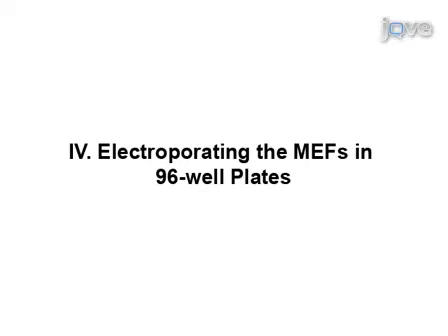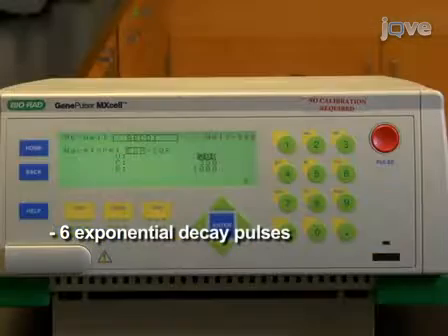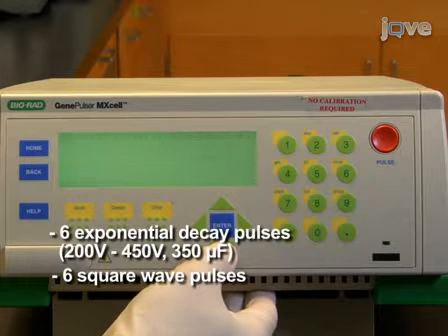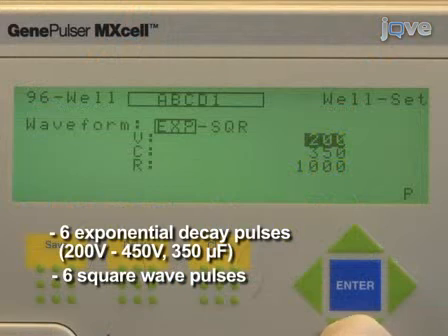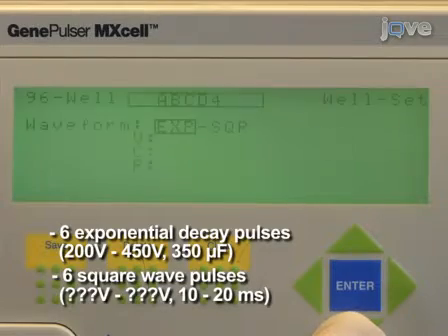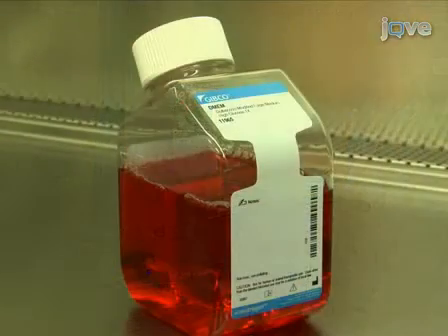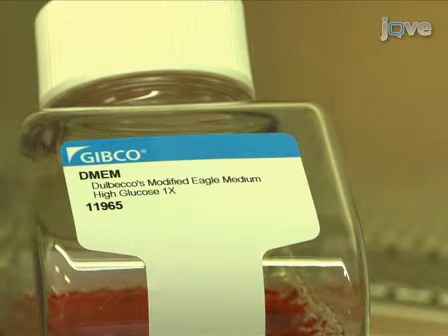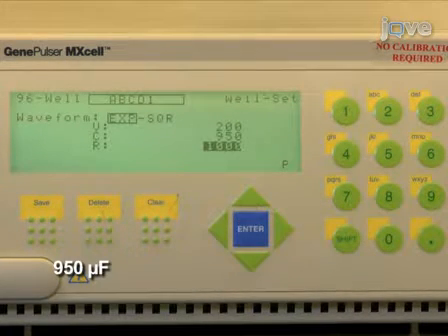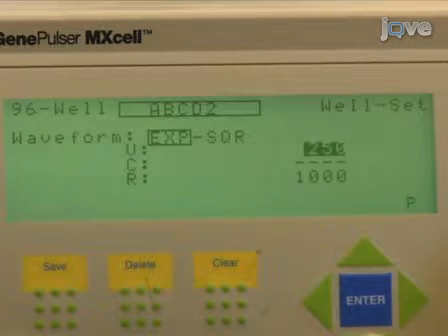Prior to electroporation, it's a good idea to check your protocol to make sure the settings are correct. This protocol will deliver six exponential decay pulses followed by six square wave pulses. The exponential decay pulses increase from 200 volts to 450 volts and all use only 350 microfarads because of the low resistance of the Gene Pulsar electroporation buffer being used. The square wave pulses vary in both voltage and pulse duration. The instrument's capacitance setting needs to be matched to the conductance of the electroporation mixture. If using a higher resistance buffer like DMEM, the same voltage range could be used but with a larger capacitance, such as 950 microfarads, for the exponential decay pulses. If the optimal capacitance of the buffer you are using is not known, you will also need to vary capacitance in the electroporation conditions you are testing.